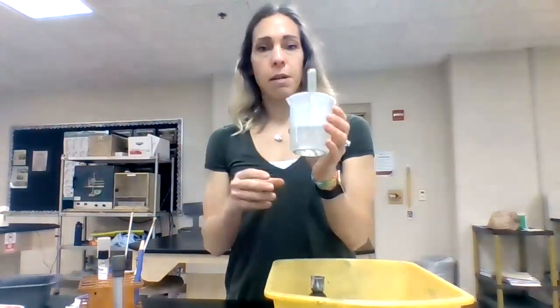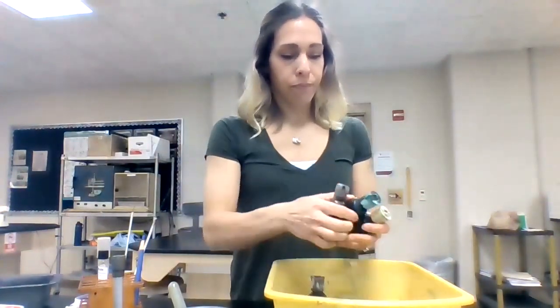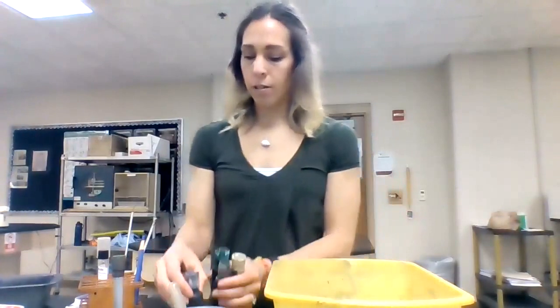You're also going to have some type of plastic cup with a dropper — it probably doesn't have water in it, but you're going to have that. And then we're going to have our stains. You should have four different colors of stain.